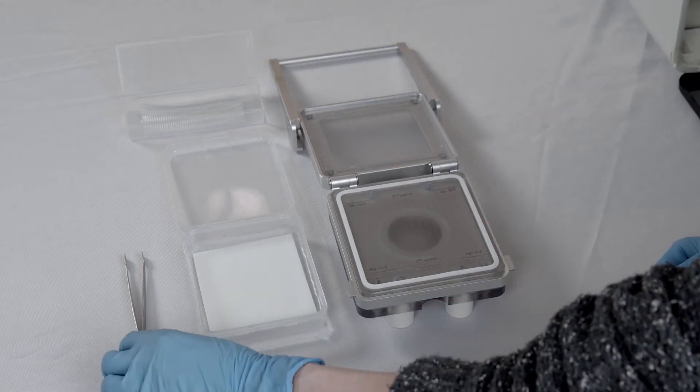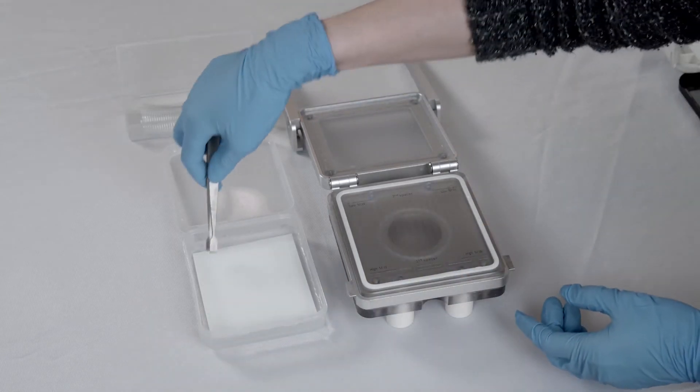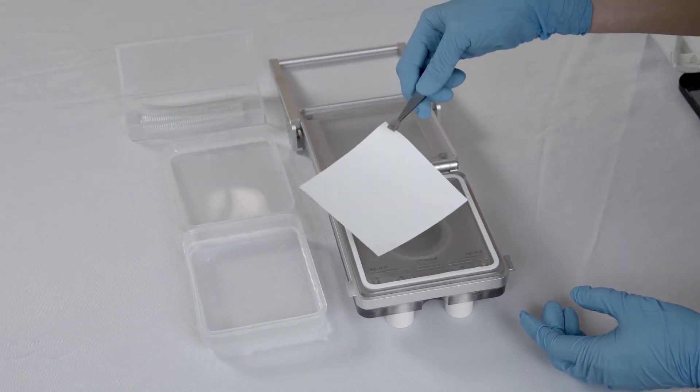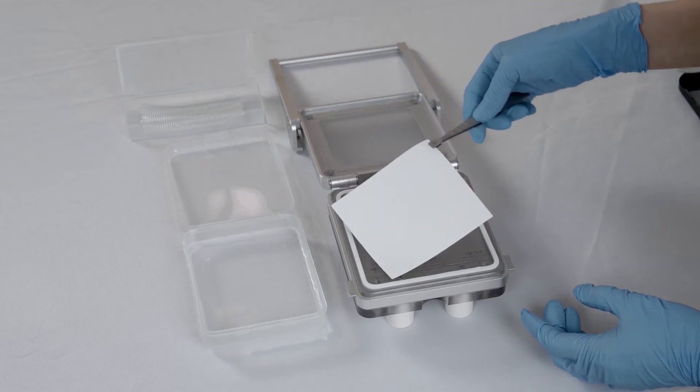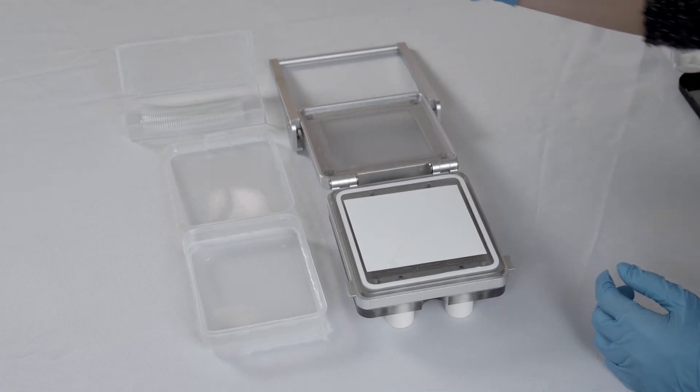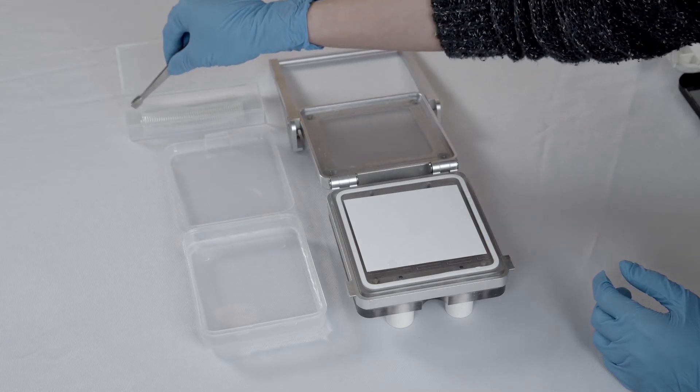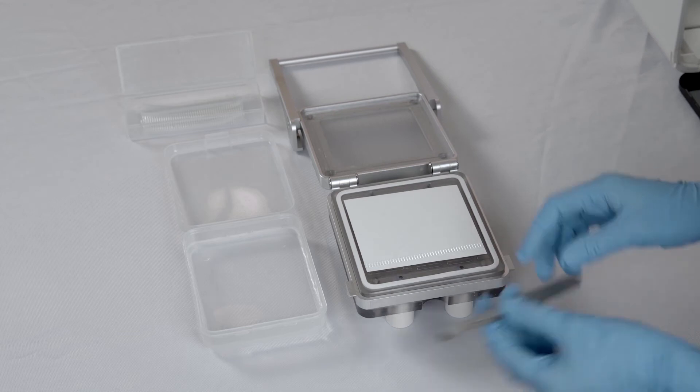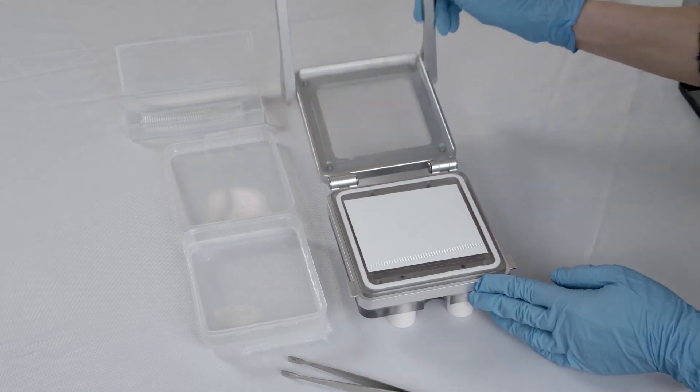Align the membrane with bands facing up on the cassette in the orientation corresponding to the markings, noting the position for high molecular weight and low molecular weight protein bands. Then place the spacer on top of the membrane, close the cassette, and insert it back to the instrument.